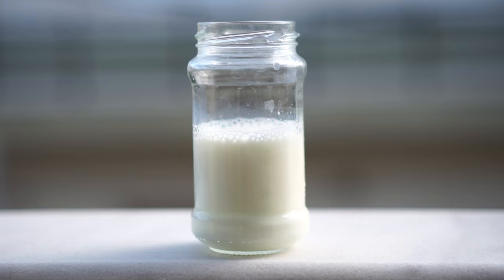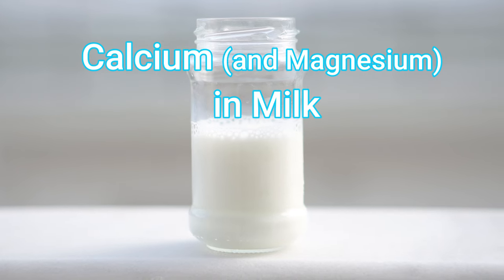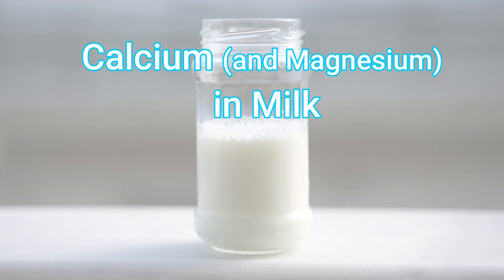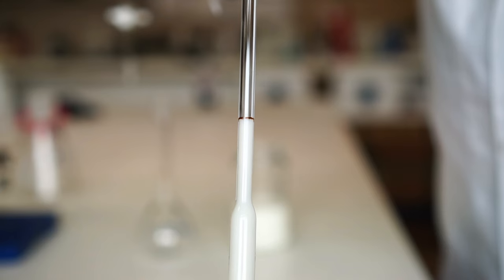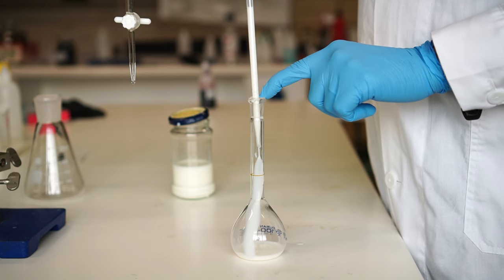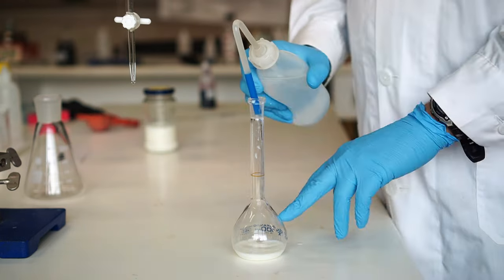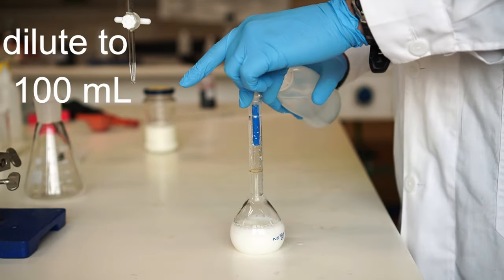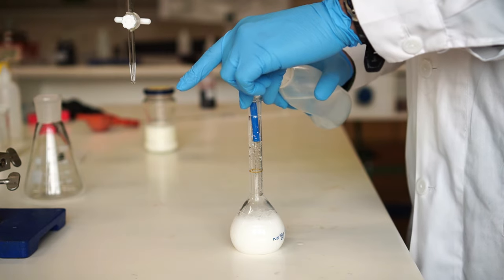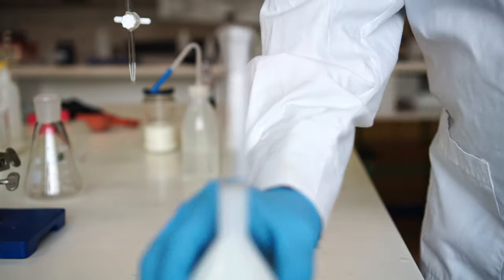This method is also suitable for determining the sum of calcium and magnesium in milk. It is essential to dilute milk samples before titration because of milk color and high concentrations of calcium and magnesium.